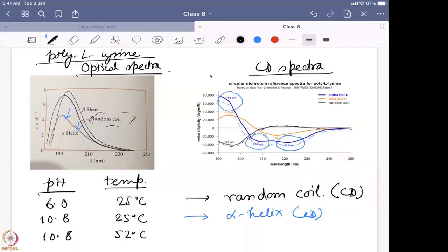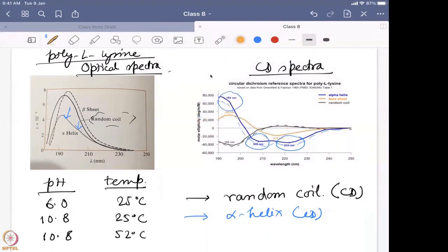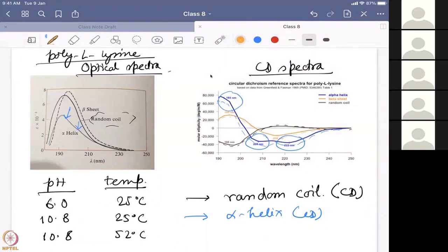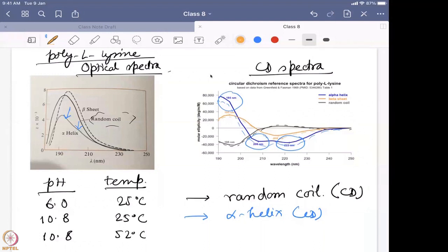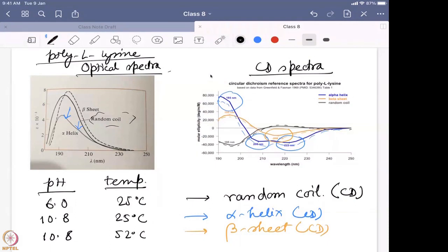At higher temperature, 52°C, you find this new band shown by the brown color data. Now instead of two humps at 208 and 222 nm, you have only one hump at 218 nm — that suggests you now have beta sheet character. All this data is supported by the CD spectra. CD spectra is much more straightforward data that you can use to find out exactly what is happening — a huge change from alpha helix to beta sheet and random coil.